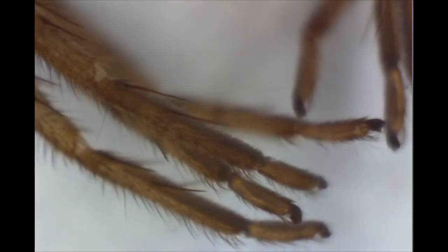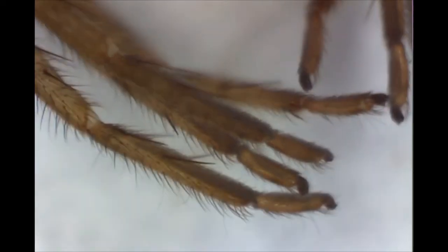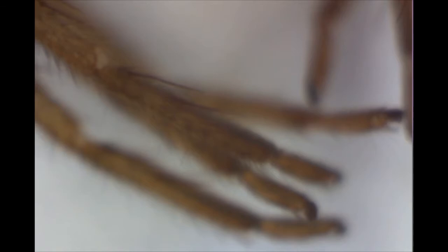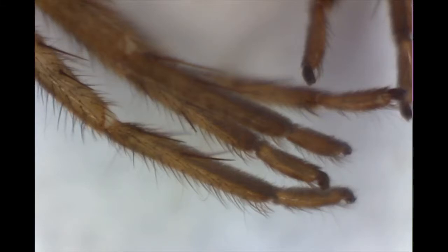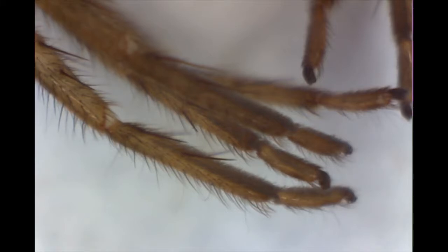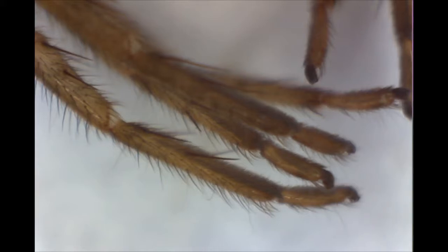Way down here — these little spider feet, right down at the end there. They kind of look like suction cups, but they enable him to climb well. I wish we could get a closer look at the feet — they're extremely small. I measured them a little while ago and they're about one tenth of a millimetre.